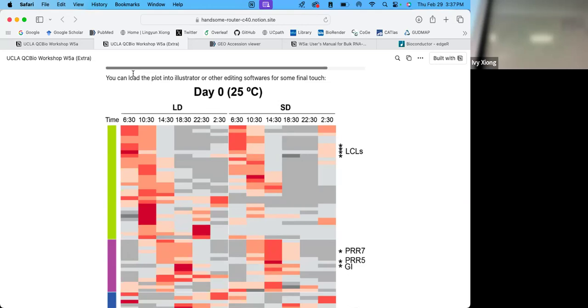It's just fast, you don't click the error code to read. Oh. Mine said rejected some reads. It's a filter. And then we load it again.